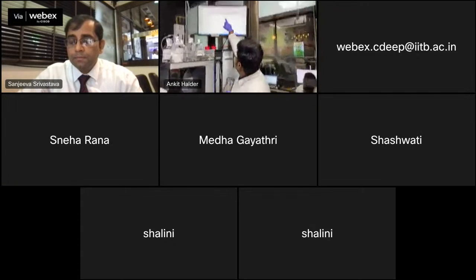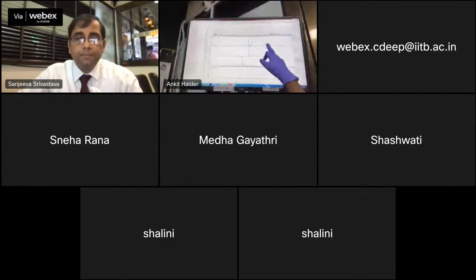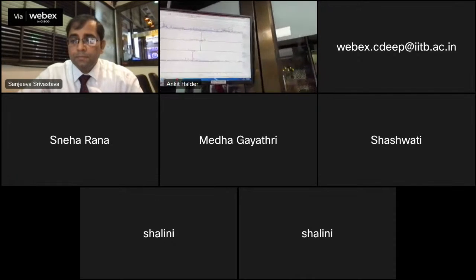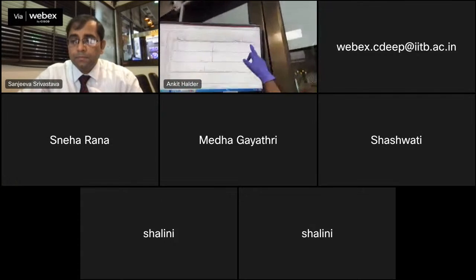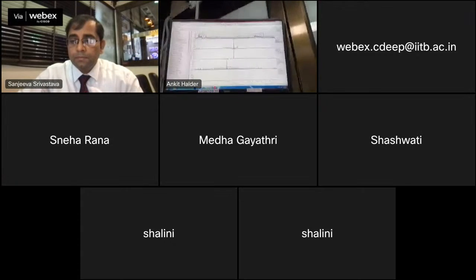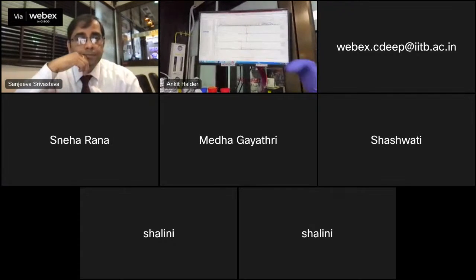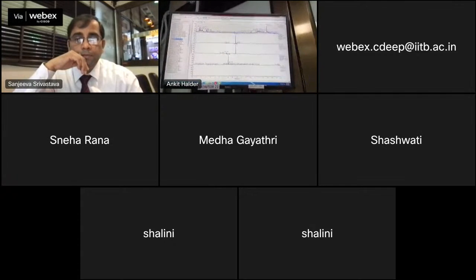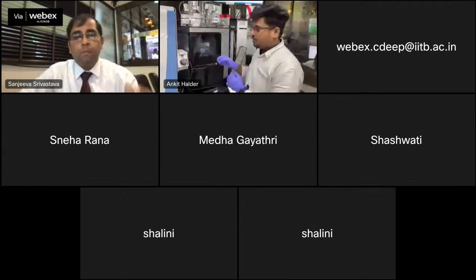So the first thing we see is the retention time of 9.55, and this is the m/z 609.27761, the m/z of reserpine. For this retention time of 9.55, we try to see whether it is coming in all the samples or not. Like this, we check all the samples one after another and monitor whether this 9.55 is coming or not. This is the initial monitoring that we do to understand that the samples have been run properly.